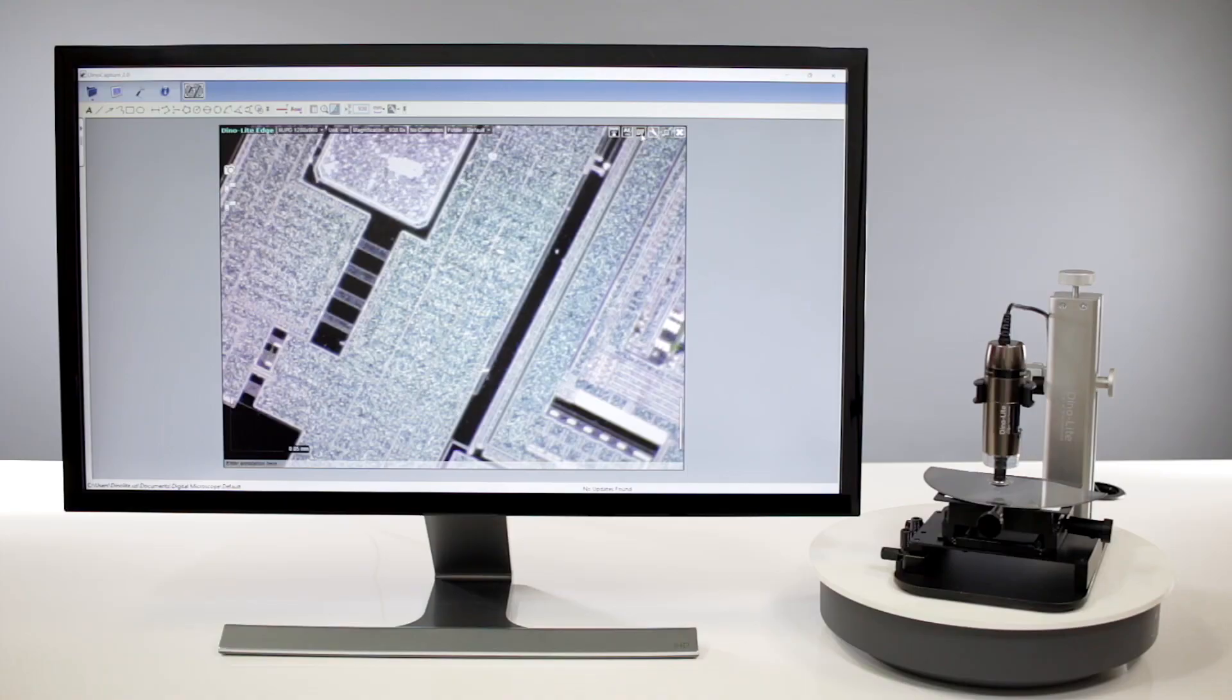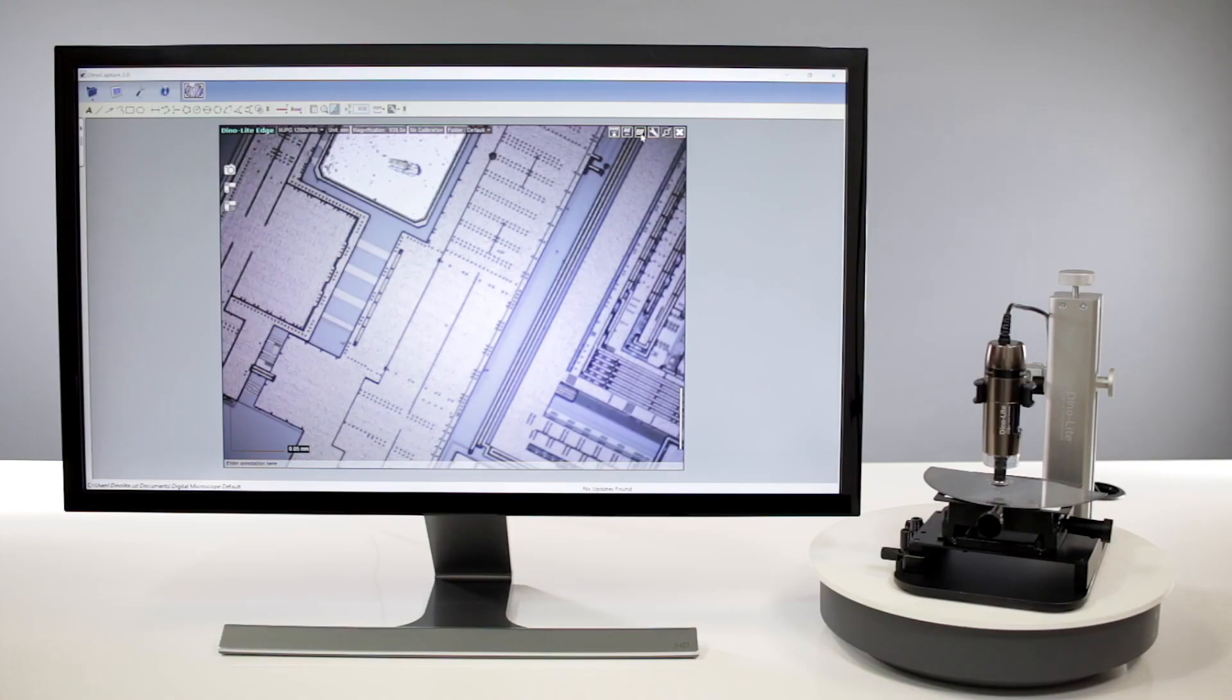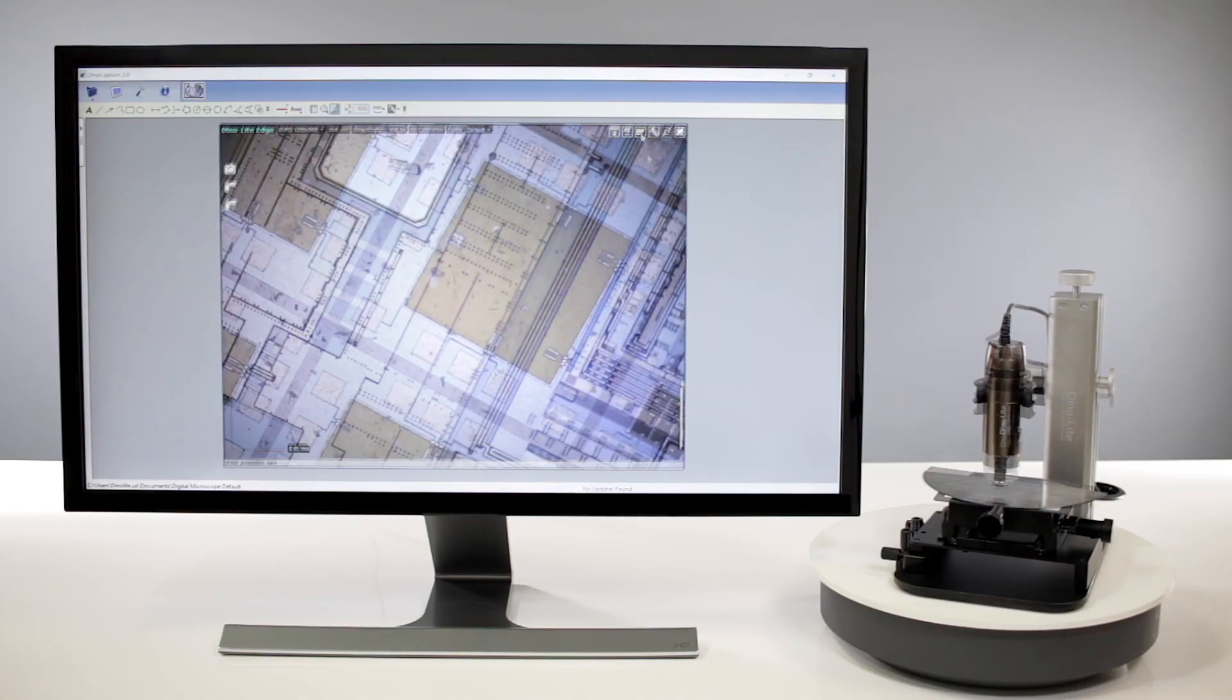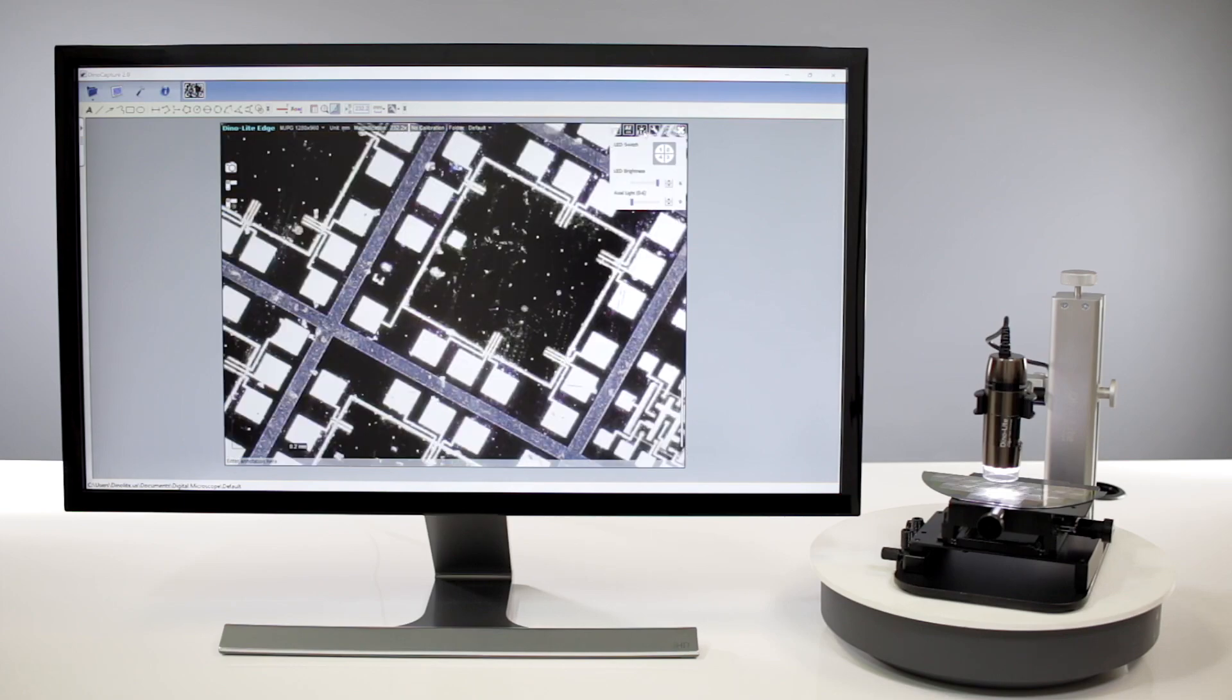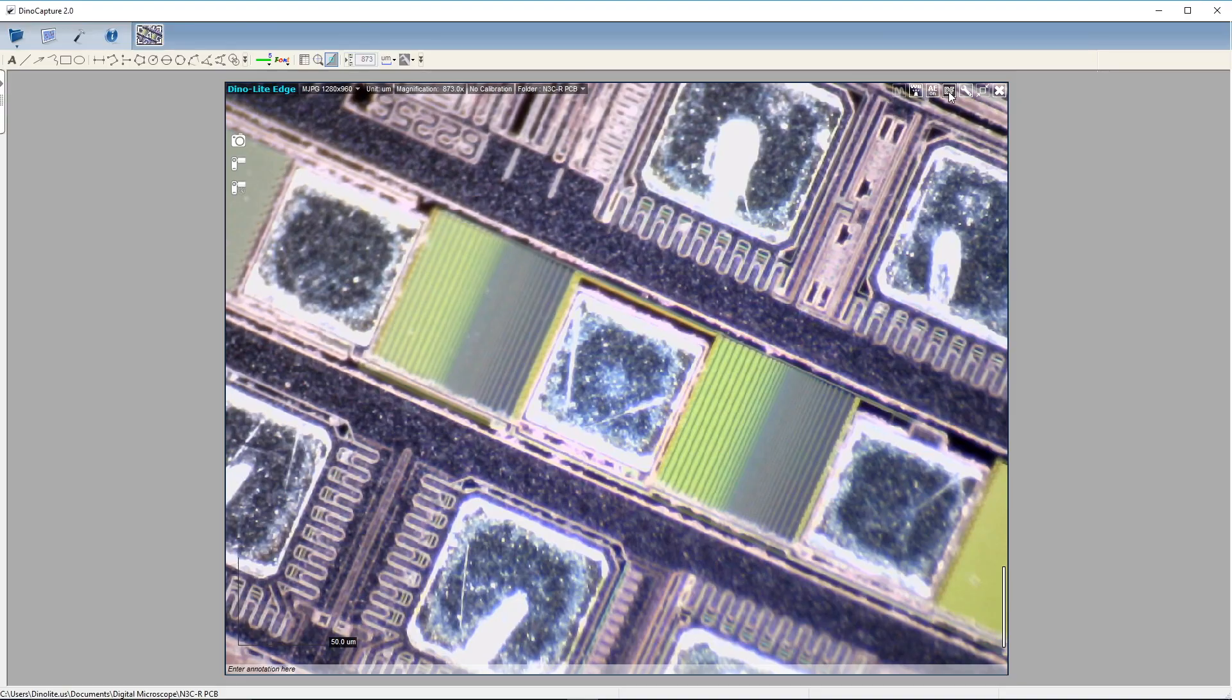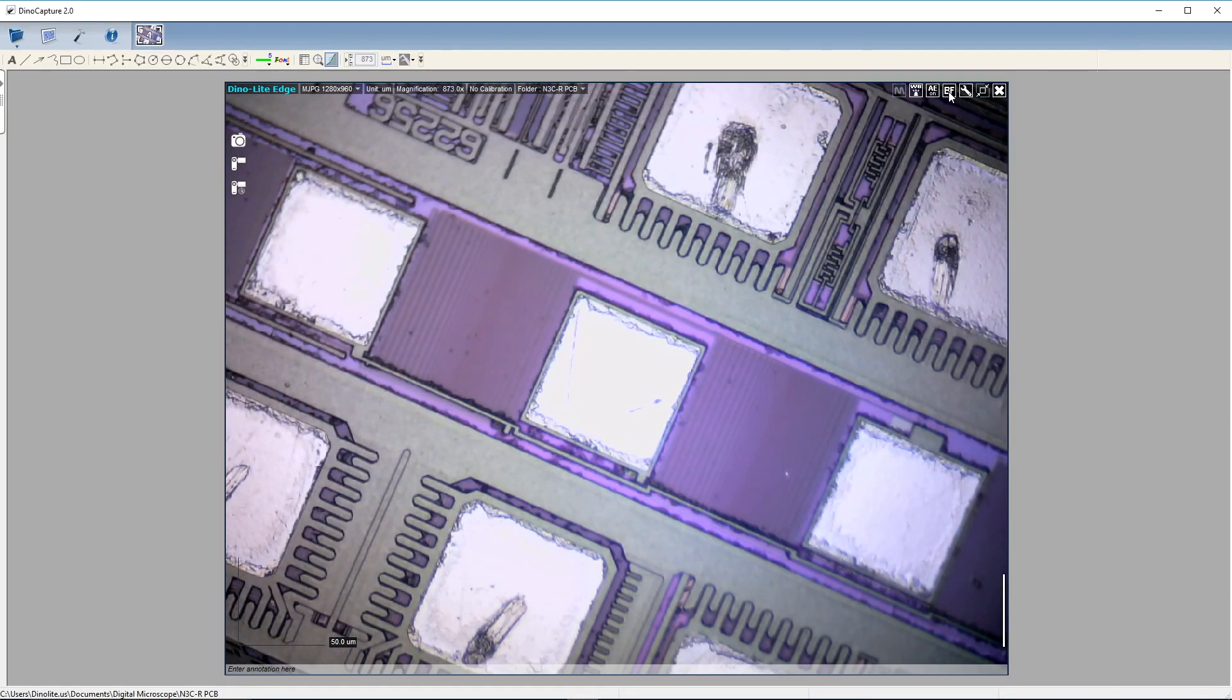By using coaxial lighting, you're able to see a drastic change in viewable details on the surface of these viewing objects.